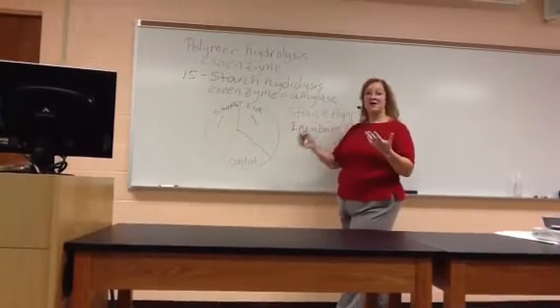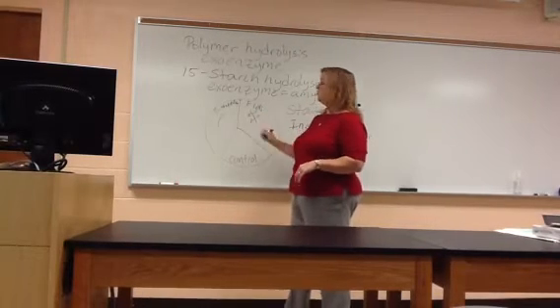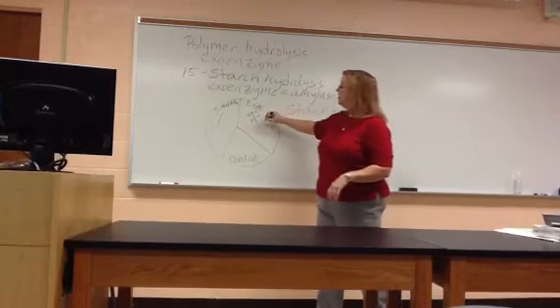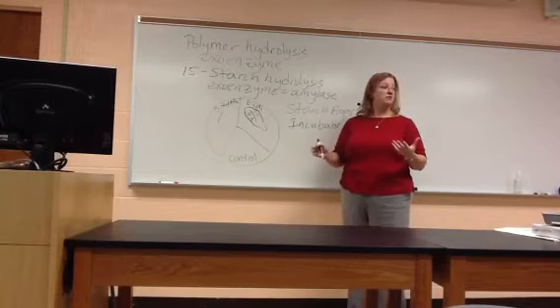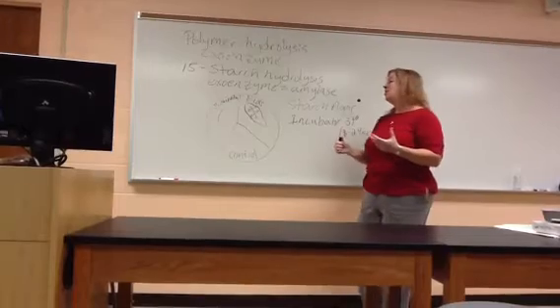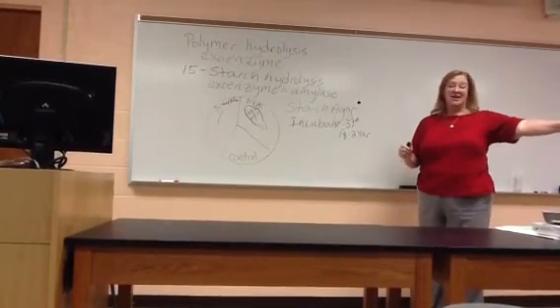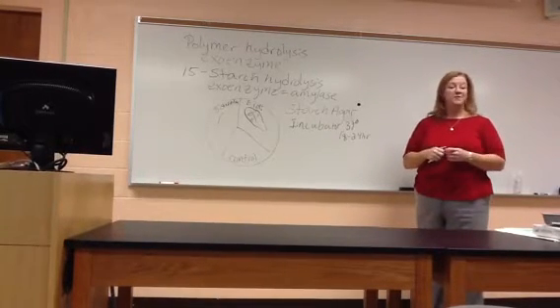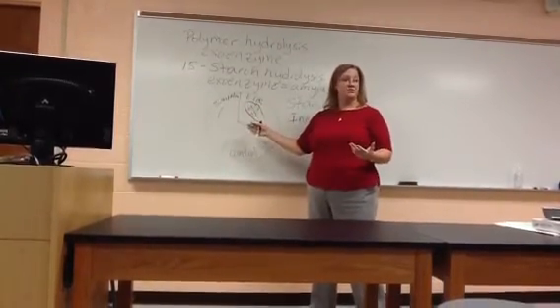They're secreting it to the outside of the cell. And because agar is kind of porous, it's going to move away by diffusion. They're releasing amylase, it's going to diffuse through the agar. So all of the starch around that bacteria should be gone. Amylase should have done hydrolysis, broken it down into sugars. We're not going to be able to see that when we come back on Monday, because the starch agar plate, the tan one over there, looks just like nutrient agar. It's going to look just like that when we come back on Monday. So it's not going to be easy for us to tell whether or not they've secreted amylase.